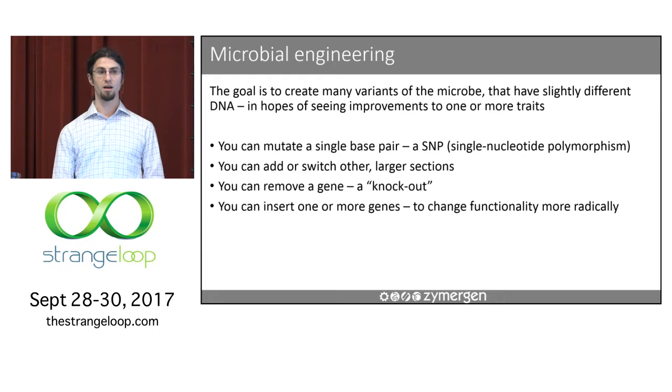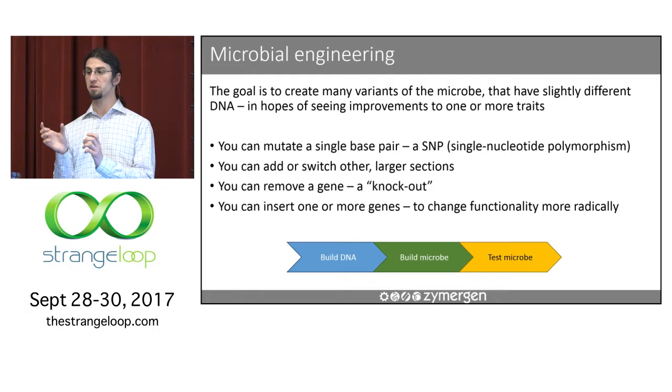All of this is done in a three-step manufacturing process. First, we build short snippets of DNA that are going to perform the change. Then we build the microbe by introducing that DNA into the microbe and letting the change happen.